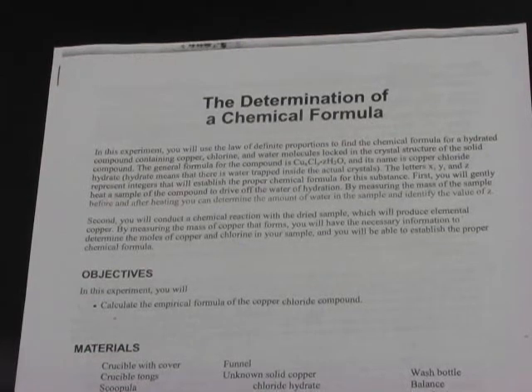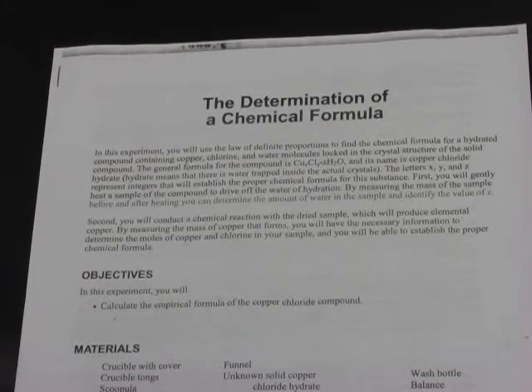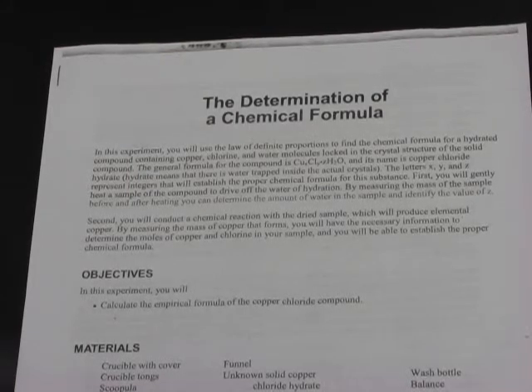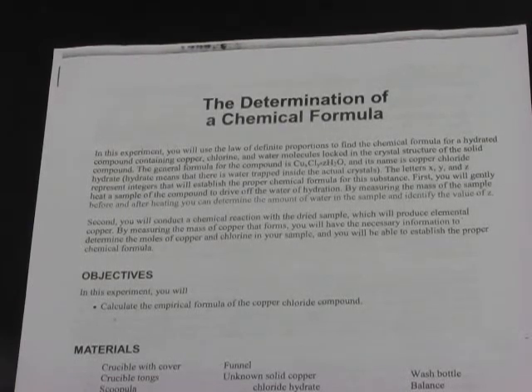The lab we will be completing is called Determination of a Chemical Formula. By reading the introduction paragraph, you will see that we will be determining the empirical formula of an unknown compound using laboratory data. It is important for you to watch these videos as they will contain important information about what we will be doing in lab, safety, and what equipment should be used.